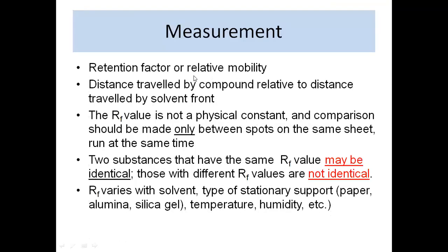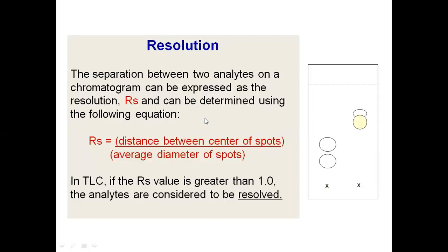And then measurement of course is based upon the retention factor. We have already seen the formula for retention factor. Okay, so I will go ahead. आणि मग इथे एक रेझोल्युशन नावाची कन्सेप्ट मांडलेली आहे की कशाला चांगलं बनायचं सेपरेशन. आता तुम्ही जर ह्या डायग्राम मध्ये बघितलं तर ह्या, can you see my slide here, schematic diagram दाखवली आहे, ते दिसतंय का तुम्हाला? Yes or no?